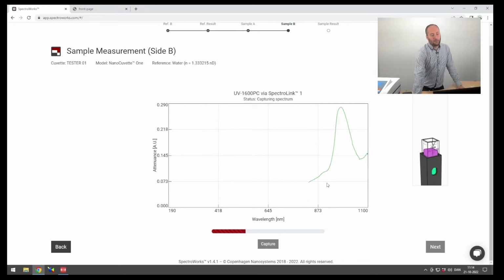What we're seeing now as we are beginning to go towards the 600 is that we should start getting the resonance of the crystal again. So it starts going up here. To the naked eye, it will be difficult to see, but there will be a slight shift in this resonance. That's because the sugar-rich water has changed the speed of light within the sample, and therefore the resonance of the crystal will shift accordingly. That's how we can measure the sugar concentration based on refractive index, which is a direct measure of the speed of light.